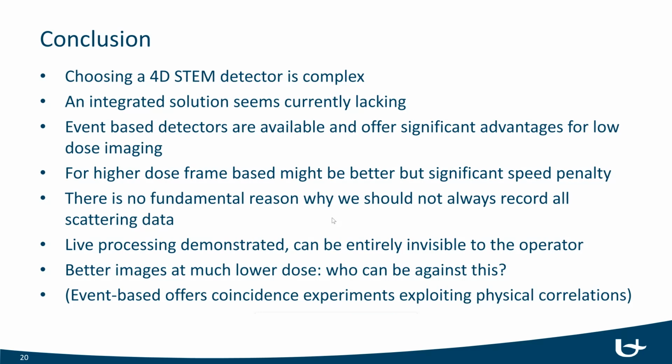We demonstrated live processing, so in the future this will be made entirely invisible to the operator. So if you're a researcher working in this domain, you can go into depth on reconstruction algorithms. But if you just care for your sample and you want to have low dose imaging on whatever materials or life science samples you're looking at, this can be made entirely invisible to the operator and you can have real-time feedback. And I think this promises better images at much lower doses.